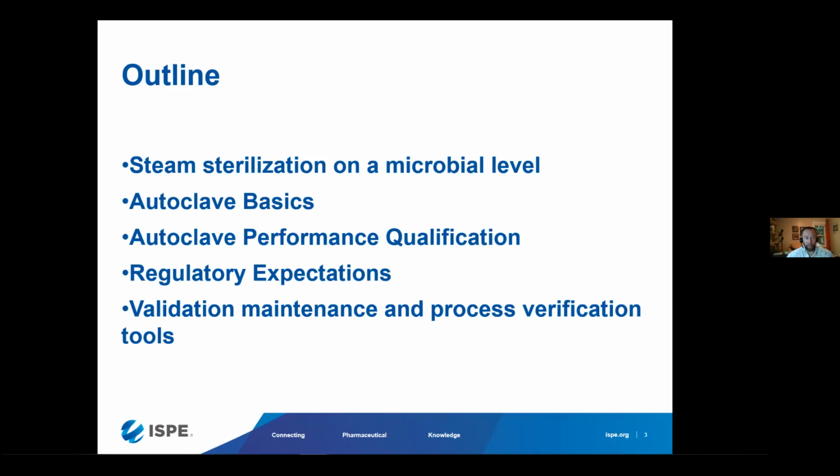Now, this is not maintenance insofar as we're mechanically working on the autoclaves, but rather maintenance using process verification tools. So this is really the part where we're confirming on a routine basis the performance of the autoclave is as we expect. And since we're on video, I do have a little bit of show and tell, so I'll leave some time at the end here to do a show and tell with these process verification tools.